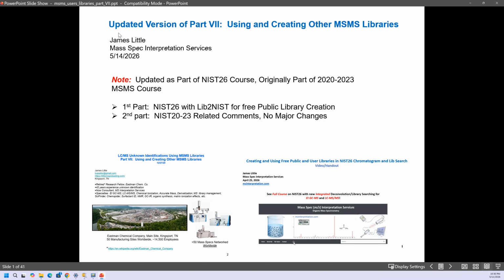The topic of this presentation is an updated version of Part 7, using and creating other MSMS libraries. Note, it is updated as part of the NIST 26 course, but it was originally part of a 2020 through 2023 MSMS course. So in the first part, I will include my new conclusions about things that are important in NIST 26 in creating user libraries.